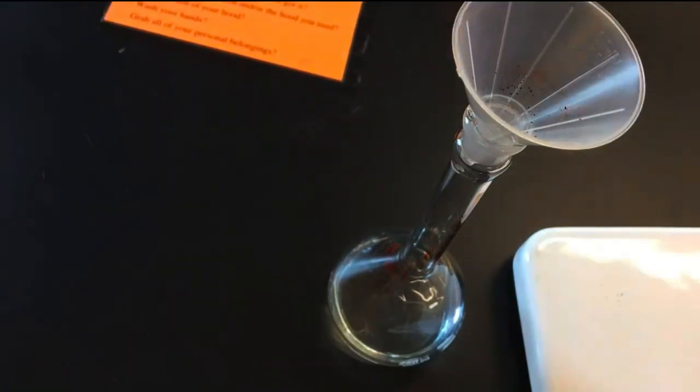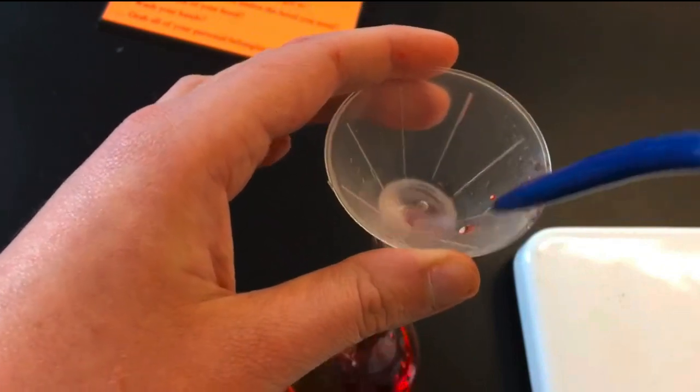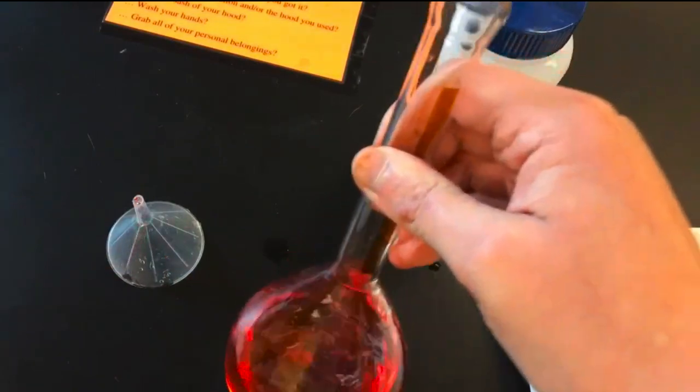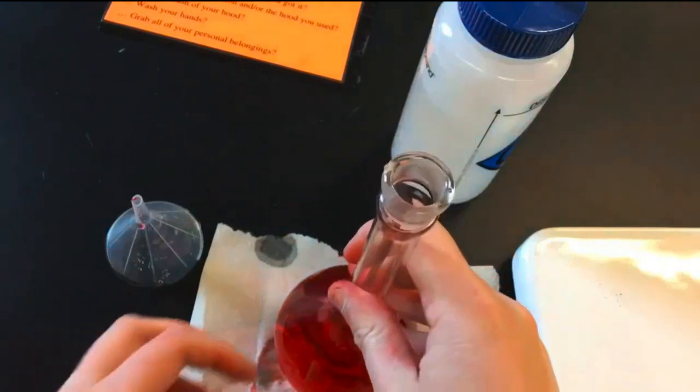Run some water down it, trying to make sure we get all of that in there, even though it's kind of not the easiest. Okay. Rinse off the funnel. I'm going to add the distilled water. See, I filled it up, pretty cool, but we're going to do the rest this way.